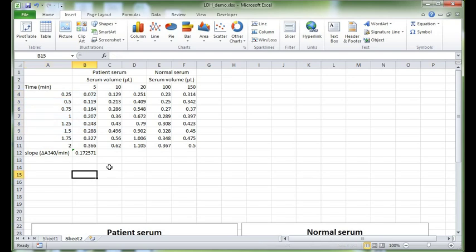Now another powerful function of Excel is called click and drag. In order to save you time having to type out this formula again and again for this cell, this cell, this cell, and this cell, you can tell Excel to propagate this formula across the entire row of cells. To do that, we put our cursor over the bottom right side of the cell, and you notice how it changes from a fat plus to a skinny plus, and we can click our mouse and drag this across the screen. But before I release the mouse, this actually won't work very nicely, and you'll soon see why.